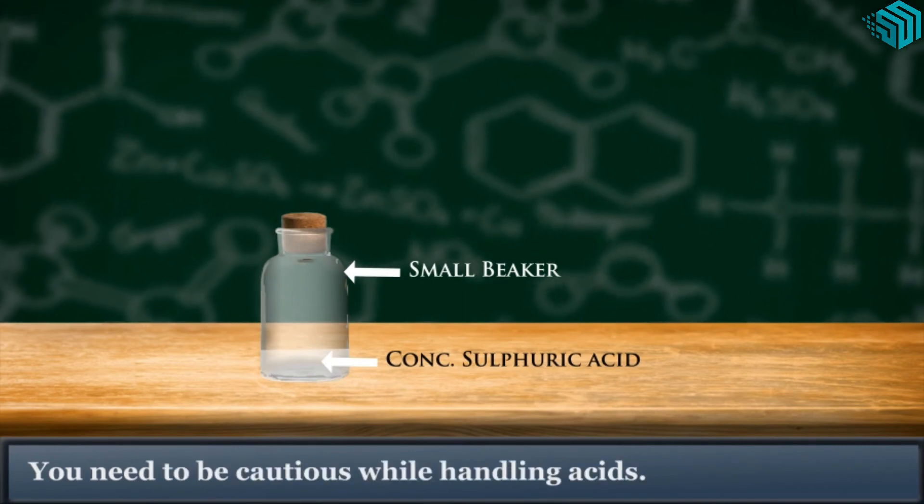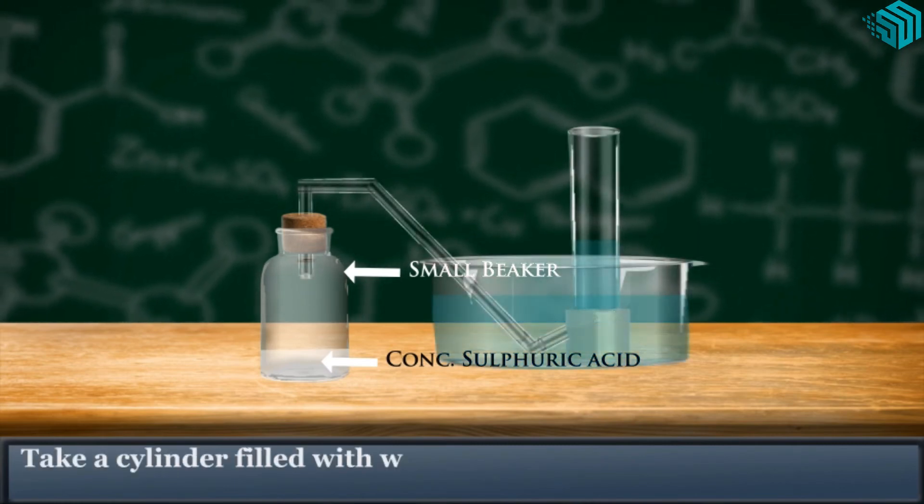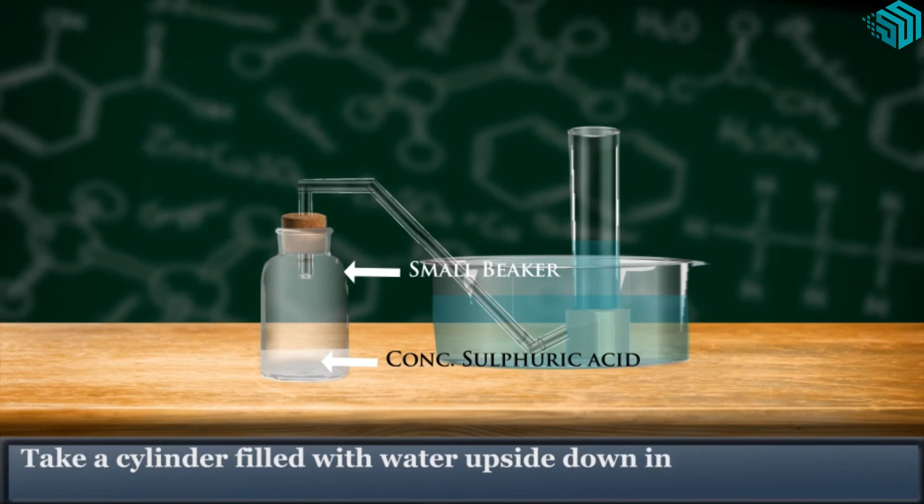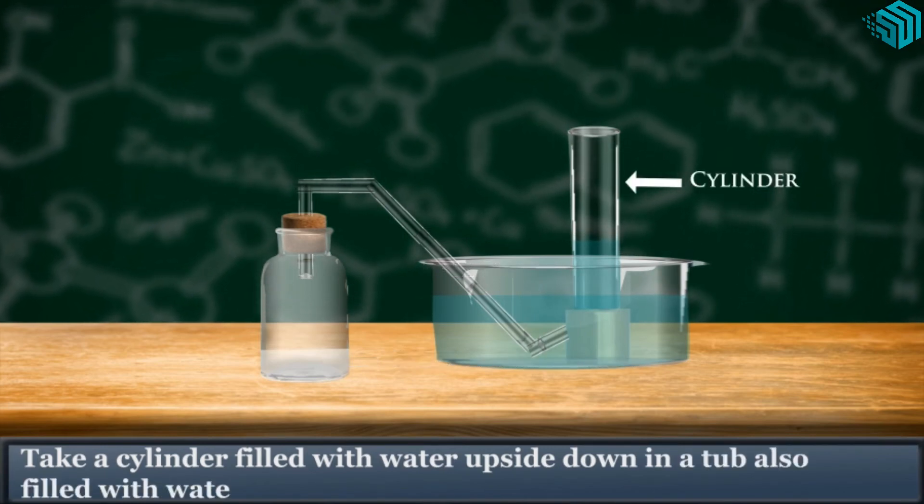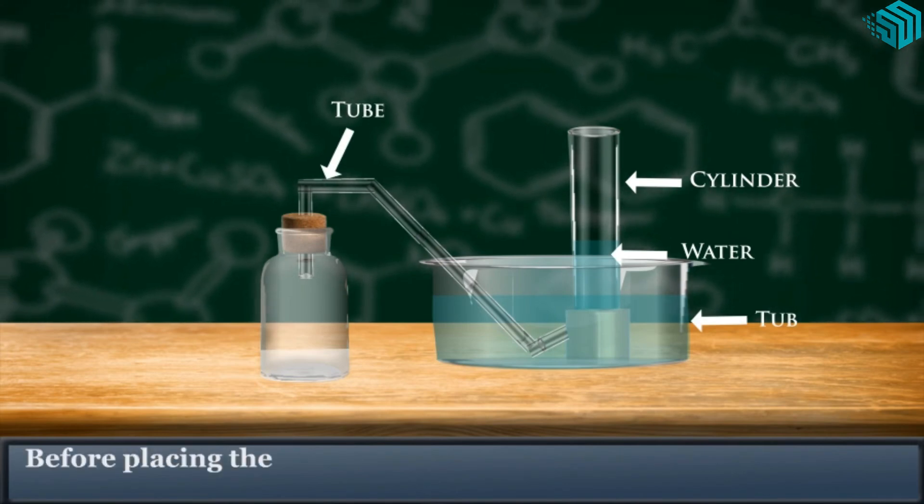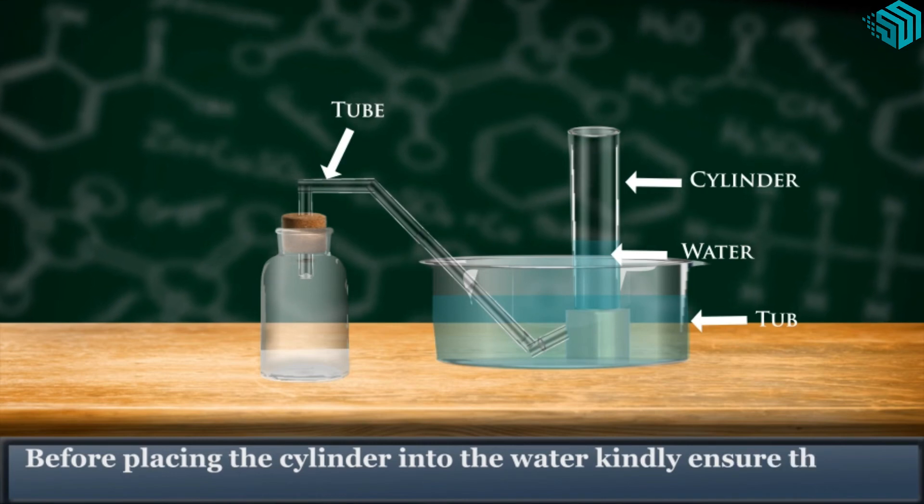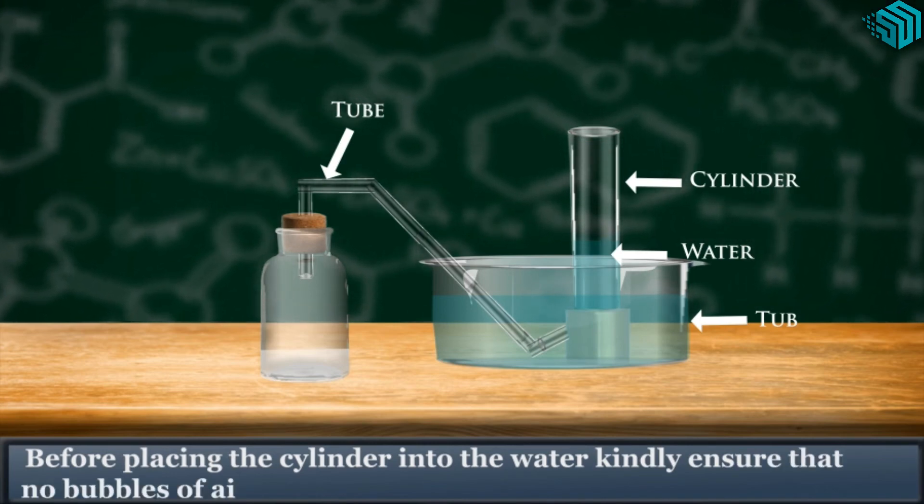Take a cylinder filled with water upside down in a tub also filled with water. Before placing the cylinder into the water, kindly ensure that no bubbles of air enter it.